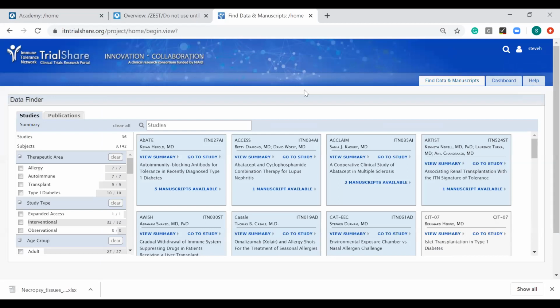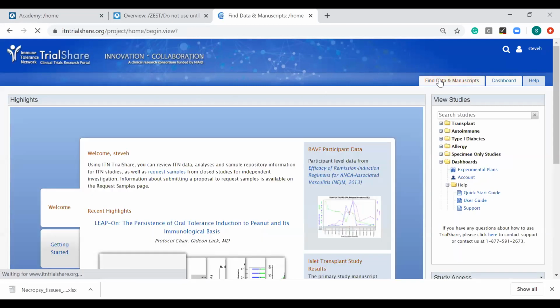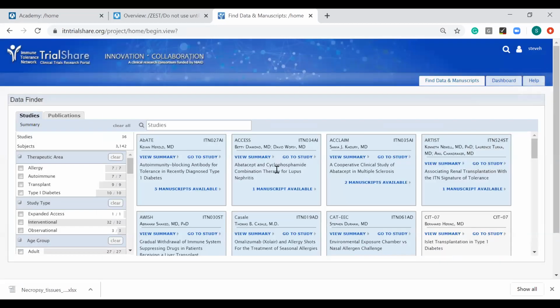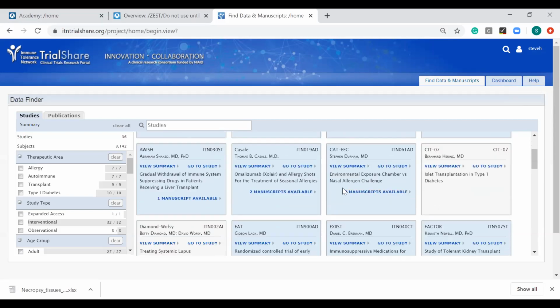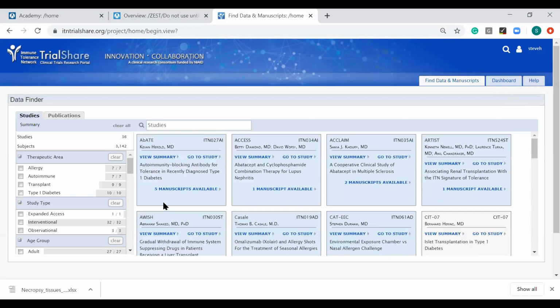Notice their UI is a little different. They've really customized their UI, and they have the familiar tabs over here, but they're different. They have different names, et cetera. And instead of a folder menu, they've presented each one of their studies as a different tile here. This is their unique UI that they've created for themselves. Again, I just want to stress that you're not stuck with the vanilla UI in LabKey. You can do something like this if you want.